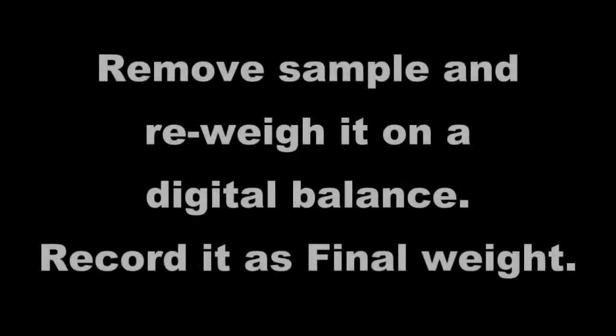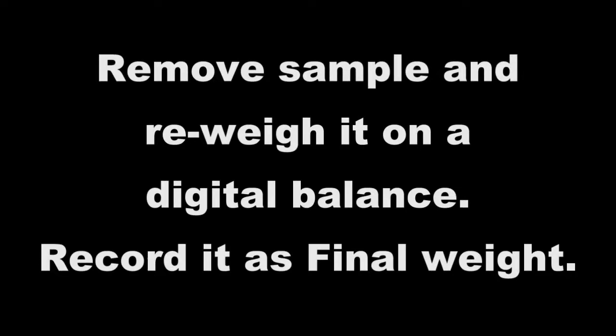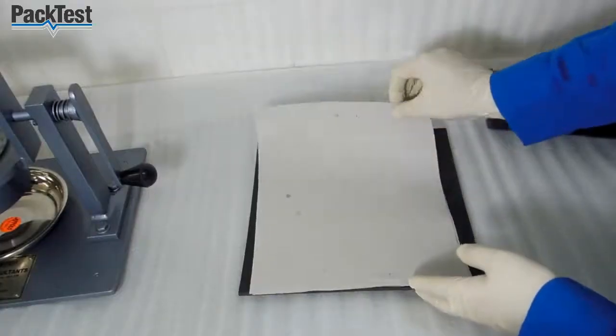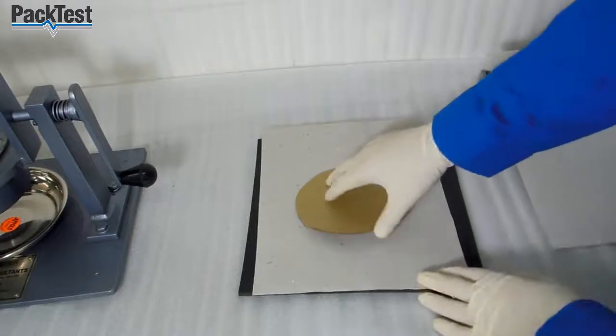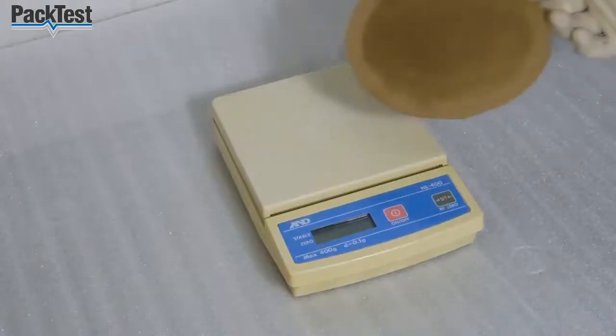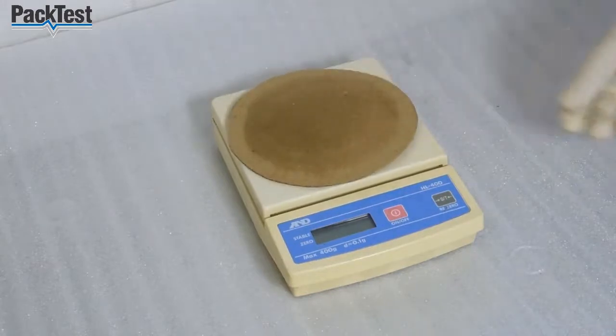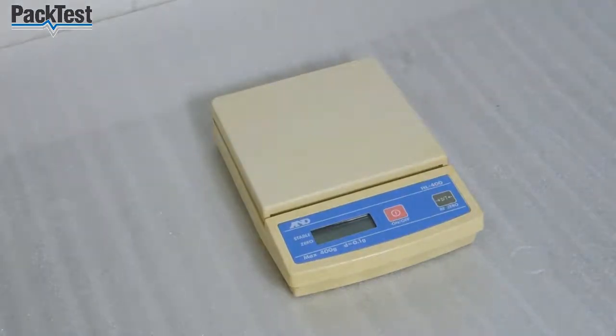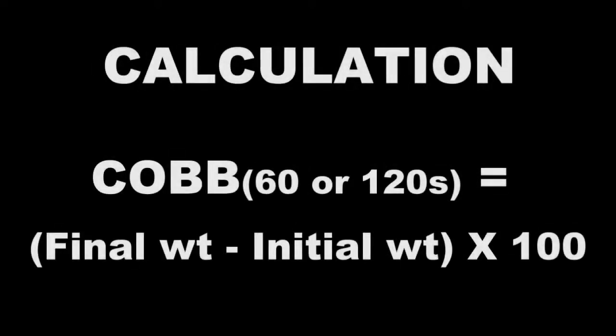Remove the sample and re-weigh it on a digital balance. Record it as final weight. Cobb equals final weight minus initial weight, multiplied by 100.